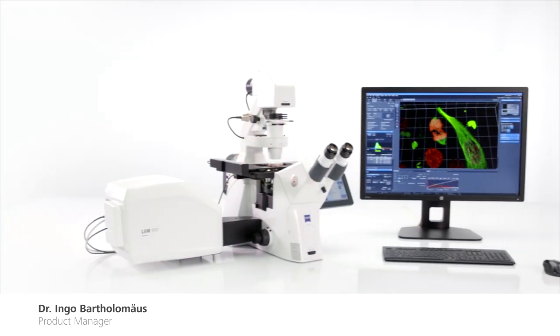My name is Ingo Bartolomeus. At ZEISS, I'm the product manager for LSM 900 with Airyscan 2.